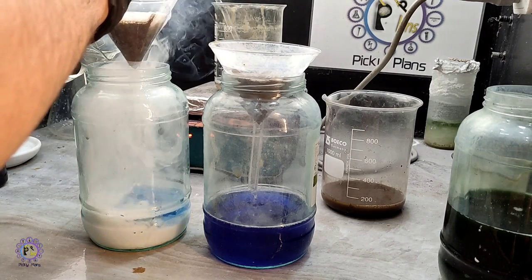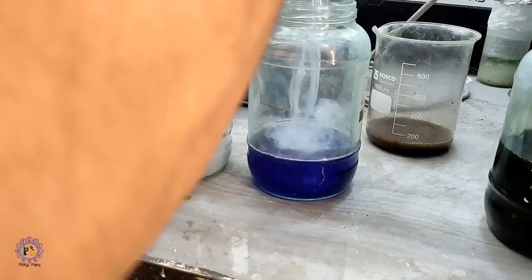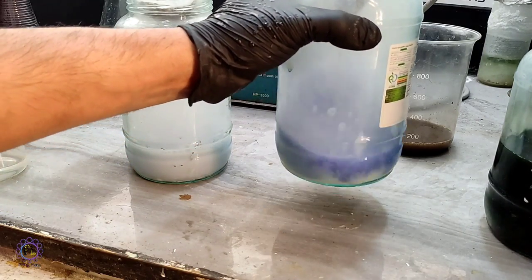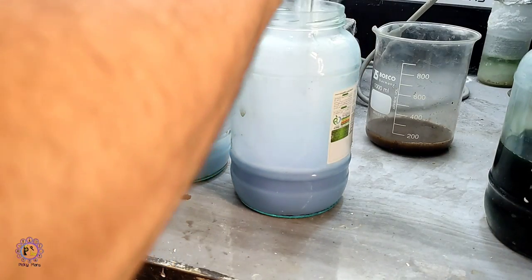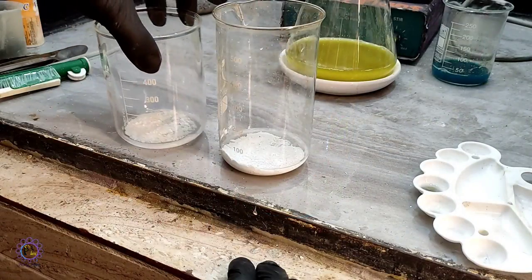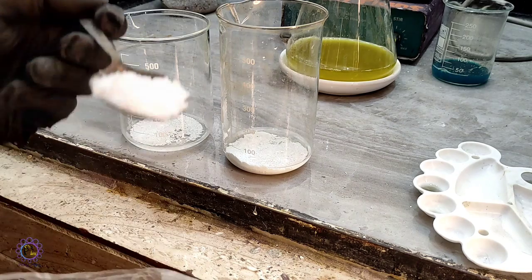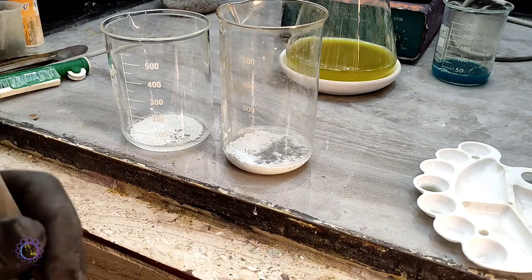Look how concentrated it is. To this one, it needs more. Solution is still blue. Silver from the magnetic materials. Convert them to silver metal. Add some sodium hydroxide. And silver turns black.